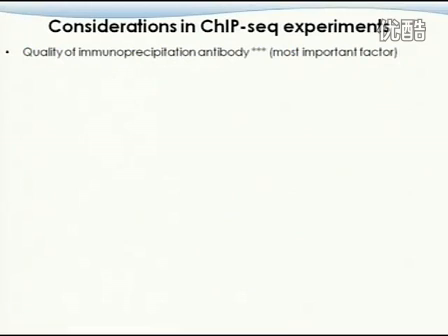I haven't personally worked on the experiment myself. But the issue is some people just assume that if an antibody works on the Western, it will automatically work on the ChIP-seq, which really doesn't happen in that way. A much higher quality antibody is required.